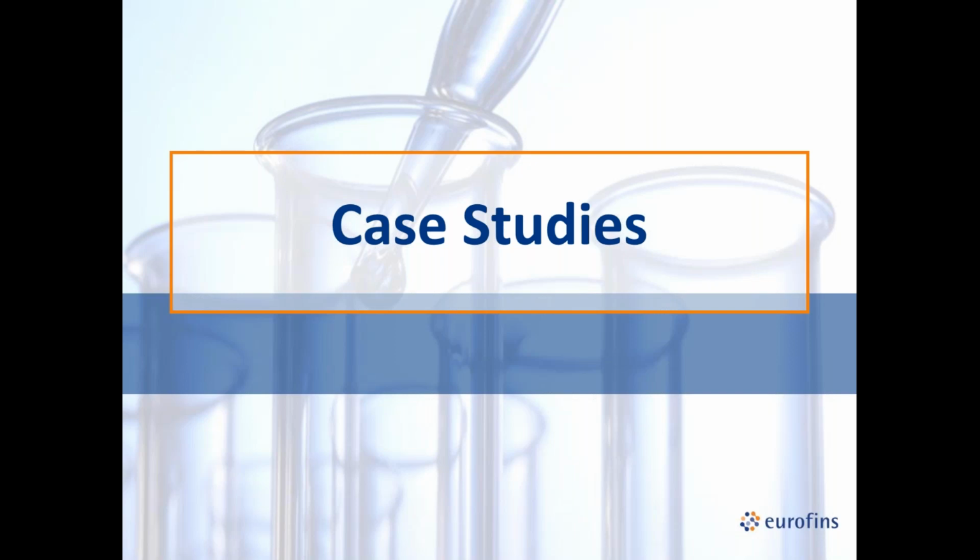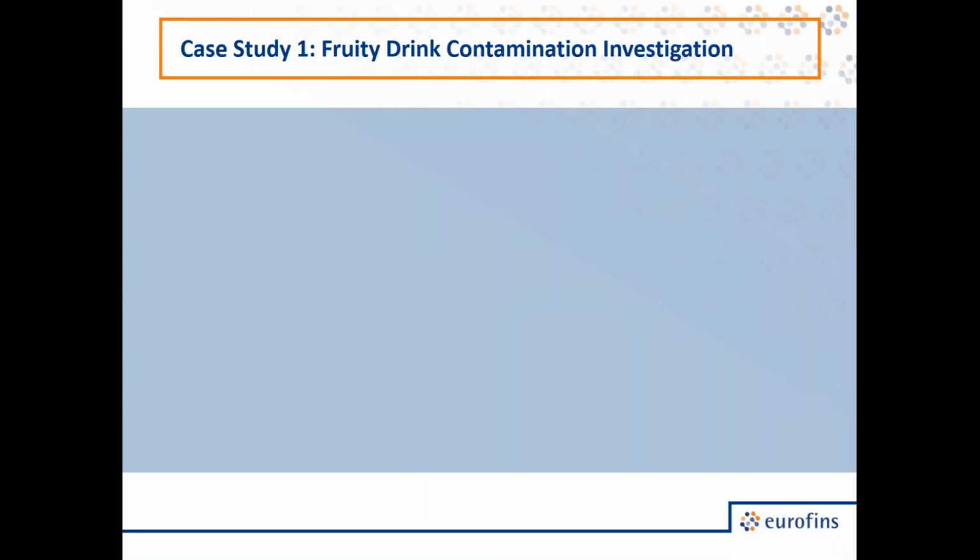Awesome. Well, thank you very much, Jamie. So as she said, we're now going to dive into some case studies. So I'm going to show you what GCMS data looks like for real-world off-odor samples, and then we will show you how we interpret what we see and link it back to an actual product issue.